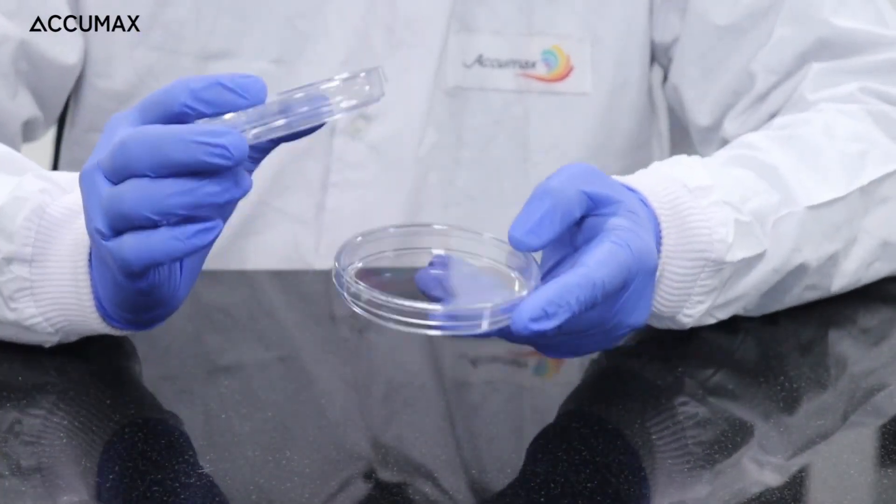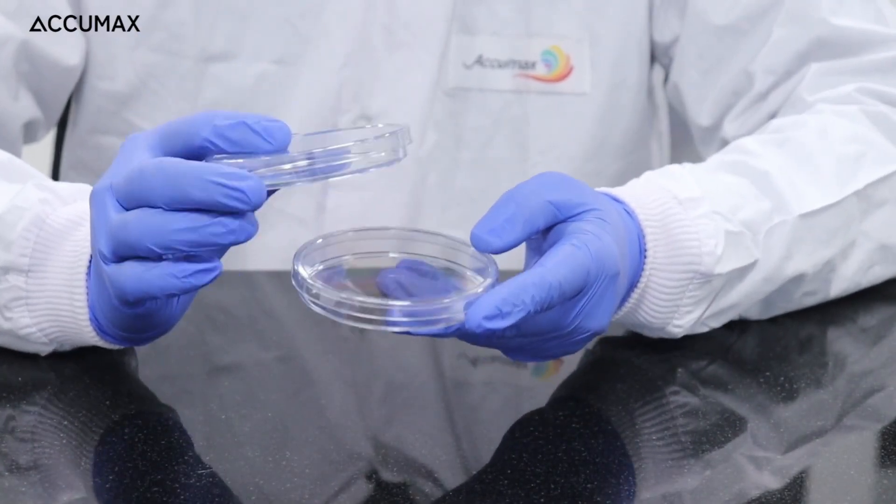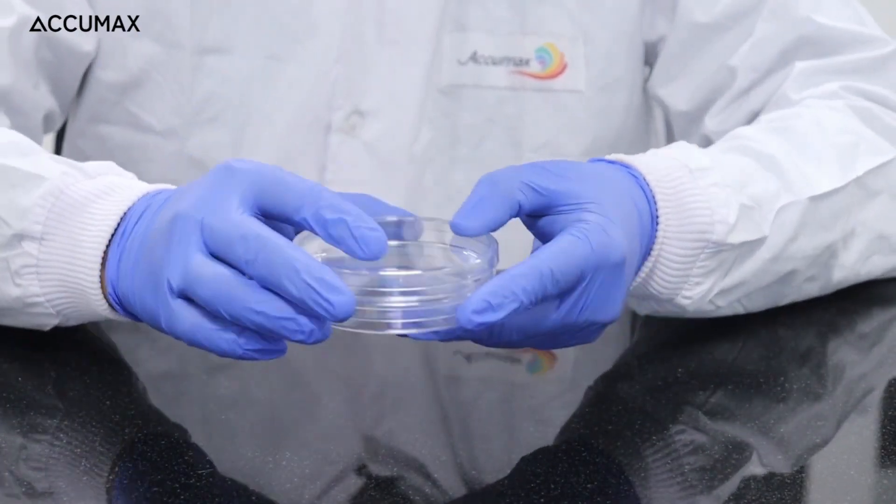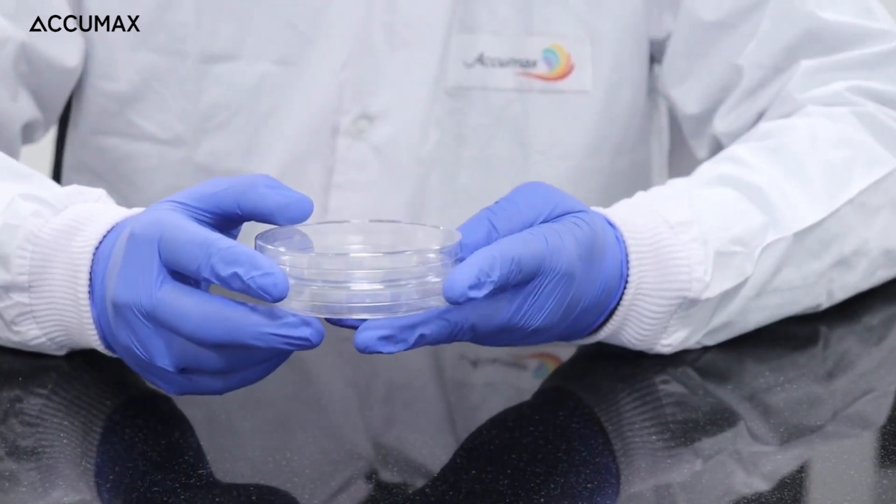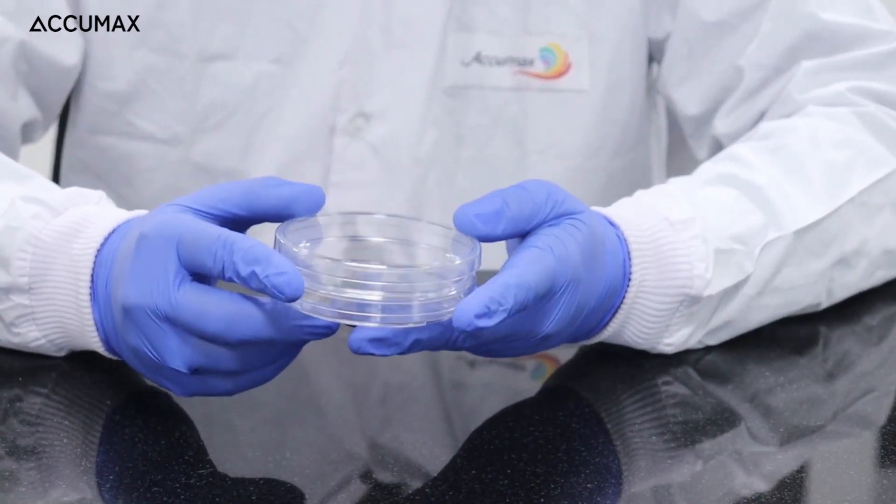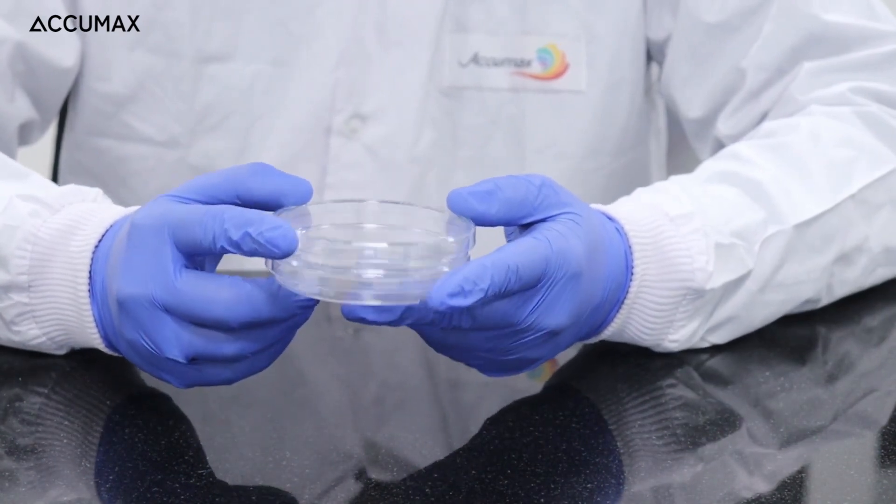These plates have beveled top and ridge bottom making them stackable and slippable, which is crucial for plates to be compatible to automated carousel systems.